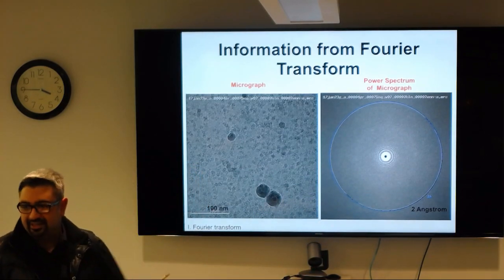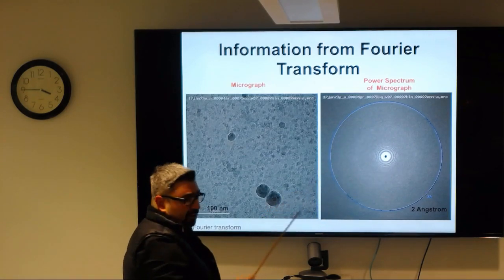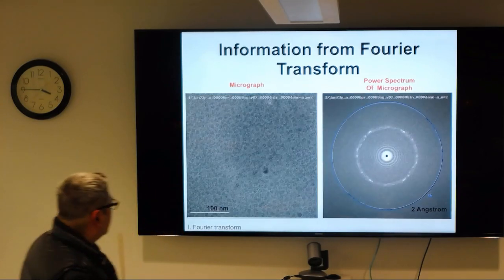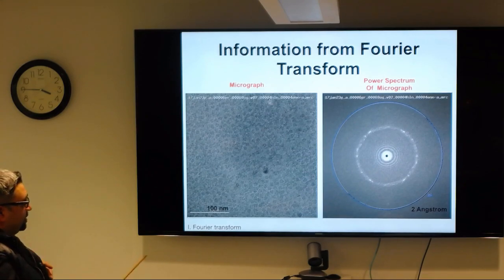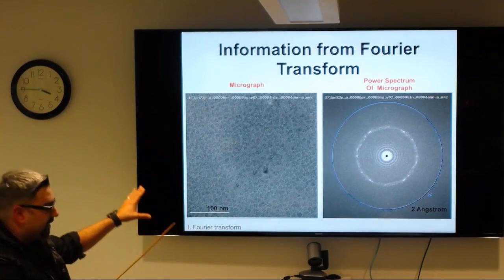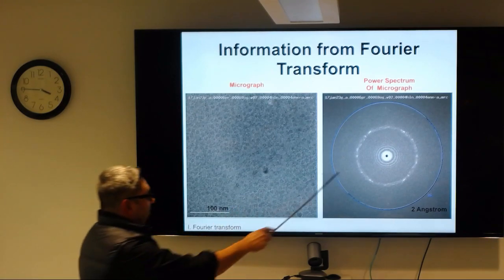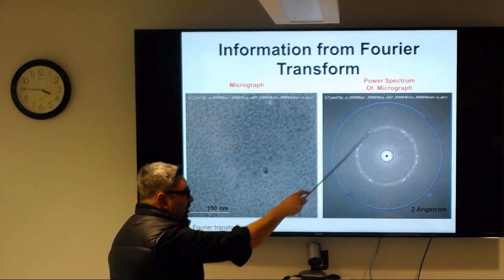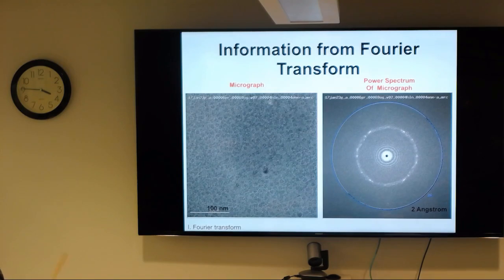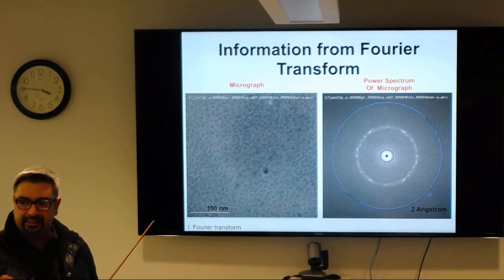It's the same thing in X-ray crystallography. When you see rings coming out further, you can see the higher resolution details. This sample has some crystalline ice. Same protein, same data set, maybe different parts of the grid. You can see at 4 angstrom there is an ice ring, which, if you're an X-ray crystallographer, you can identify. These are the types of things that we look at when we're looking at our data sets.